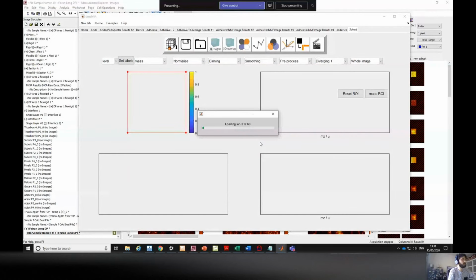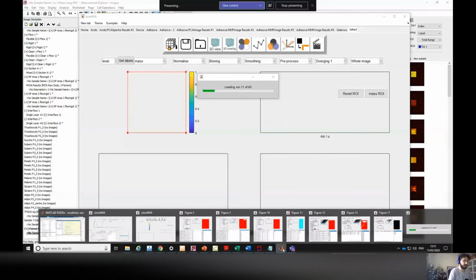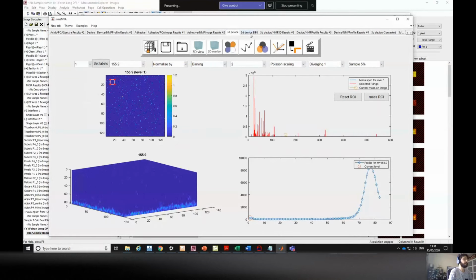It takes a bit longer as well. I think I have it loaded in another window, like in those baking shows, where the cake's already ready, right? Yeah, I have it here. So let's stop that loading.